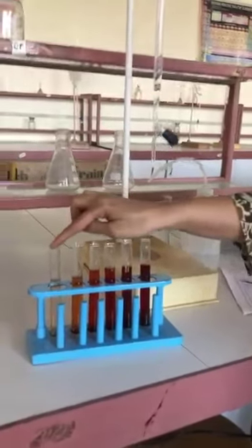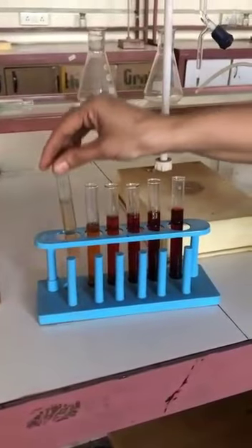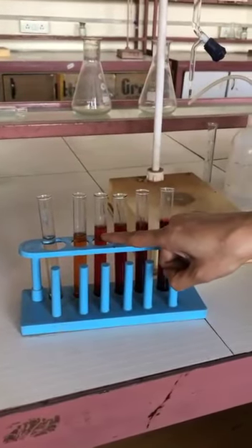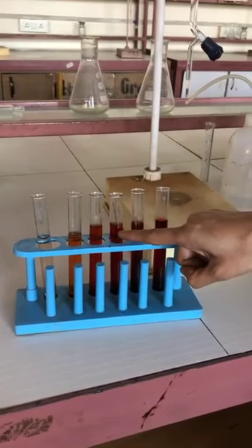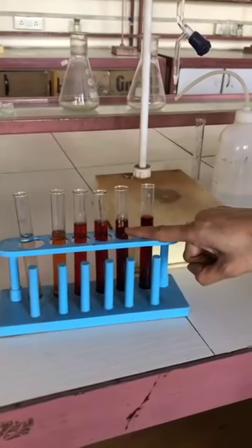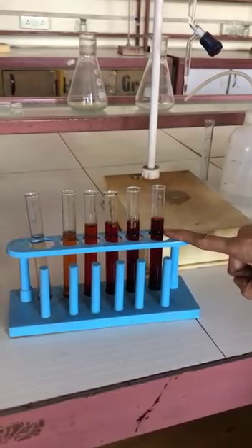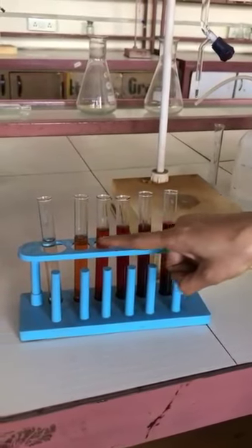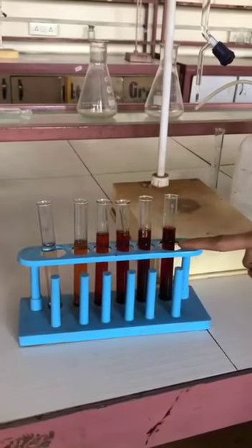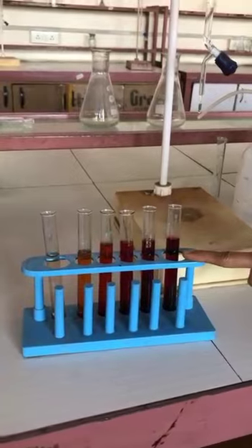In the first test tube, you have seen there is no iron sample, that's why it is colorless. In the second test tube, 0.5 ml. Third test tube, 1 ml. Fourth test tube, 1.5 ml. Fifth test tube, 2 ml. And the last test tube, the 6th test tube, 2.5 ml. As you have seen, as you increase the concentration of iron, the color intensity of the complex also increases.